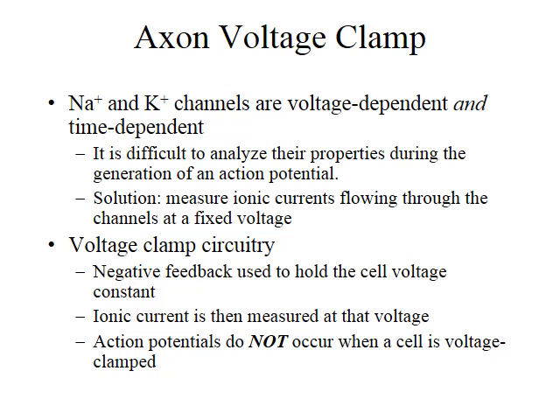And then at that fixed value, the circuit measures the current that is flowing into or out of the cell. And by measuring this ionic current, one can tell the state of the channels and whether the specific channels are open or closed, and what the kinetics of this opening and closing is.